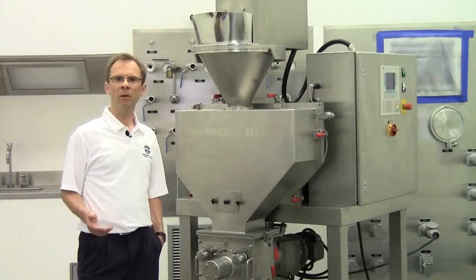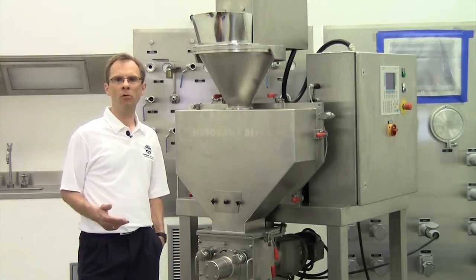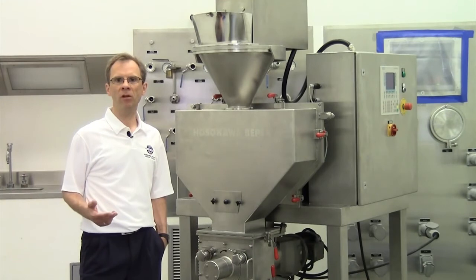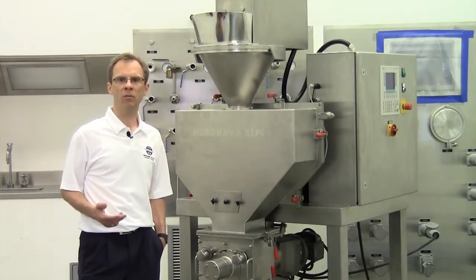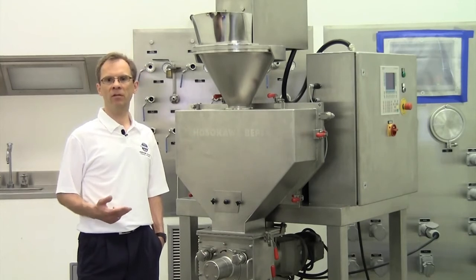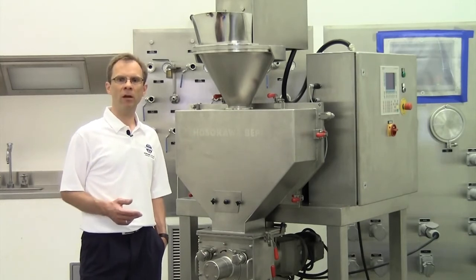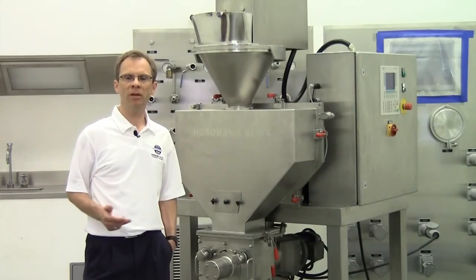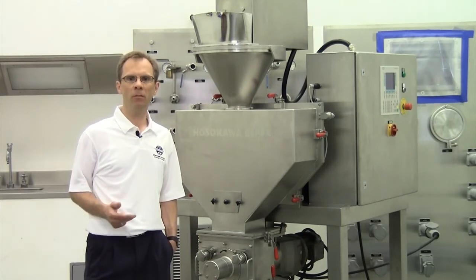Hosokawa designs and manufactures a complete line of dry roller compaction used for chemical, mineral, pharmaceutical, and cosmetic applications. We have small laboratory scale compactors up to large industrial processing systems capable of compaction of up to 240,000 pounds per hour. We build machines in mild steel, stainless steel, with or without hydraulic system, in normal execution, dust or gas tight. We offer a process where the material achieves good flow without dust, high bulk density, and low energy consumption at low wear.